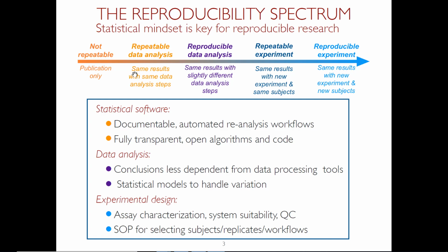Now, at the same time, and you have seen this already when you talked about OpenMS or Skyline, there are many tuning parameters in all of these analysis steps which have to be there, are really important, but they're not really critical in terms of the biological conclusions that we want to obtain. And so when our results depend too much on the tuning parameters, it's actually a problem, right? Because we want our results to reflect biology and not the tuning parameters that we have.